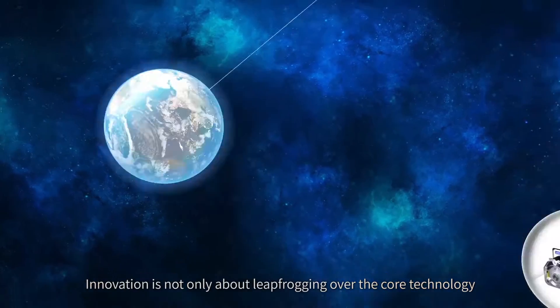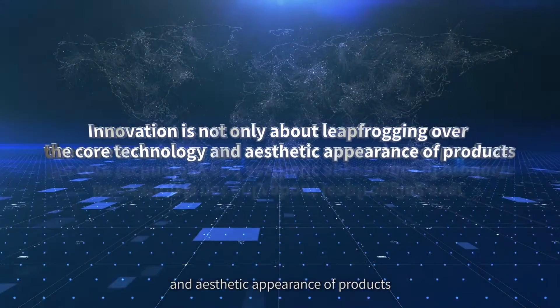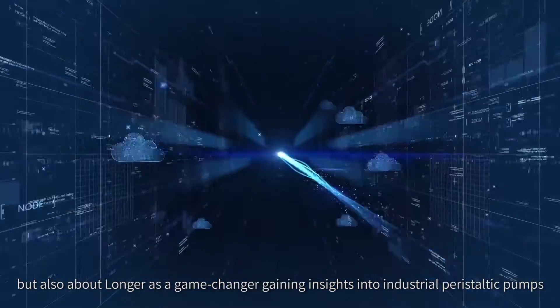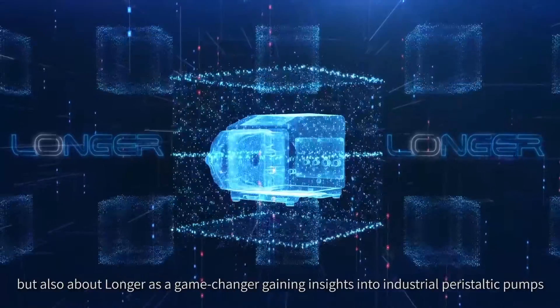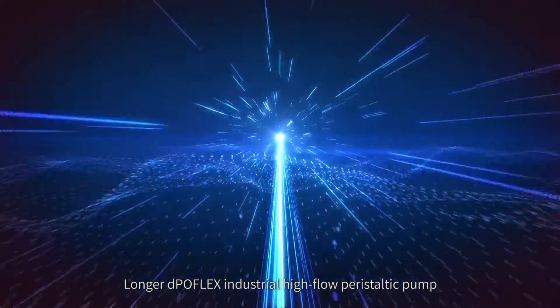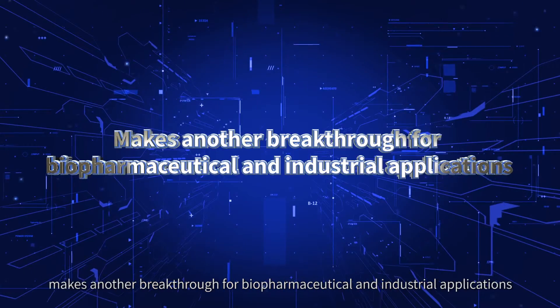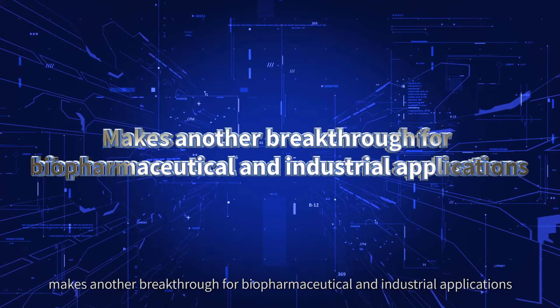Innovation is not only about leapfrogging over the core technology and aesthetic appearance of products, but also about Longer as a game-changer gaining insights into industrial peristaltic pumps. Longer dPOFLEX industrial high-flow peristaltic pump makes another breakthrough for biopharmaceutical and industrial applications.